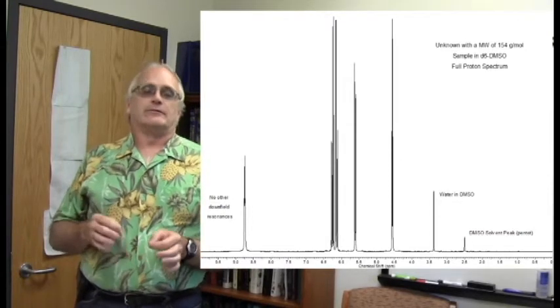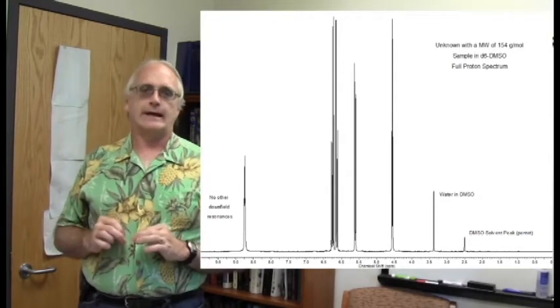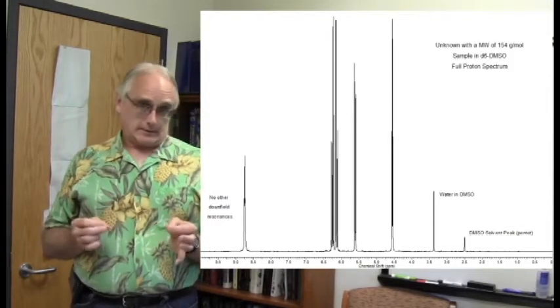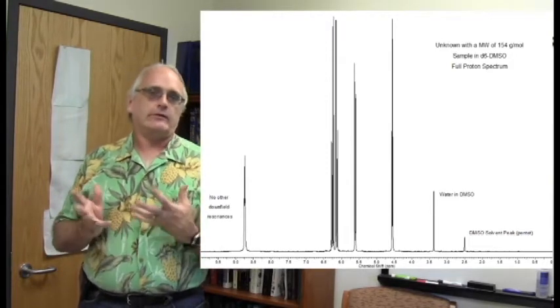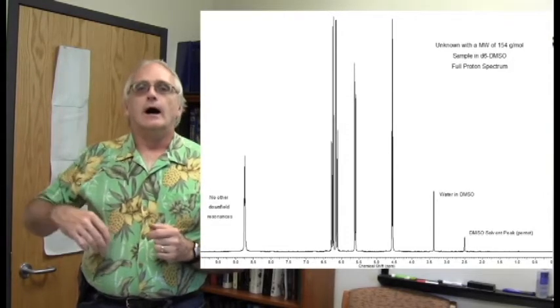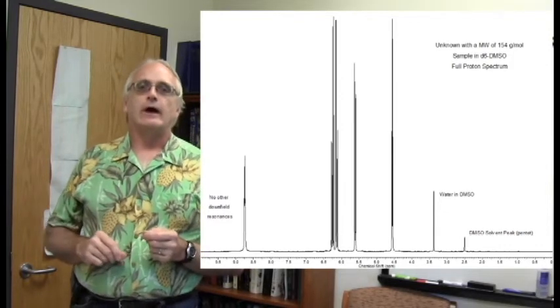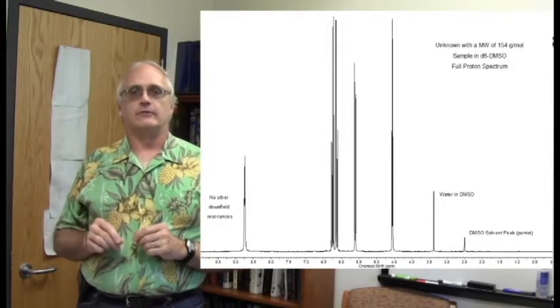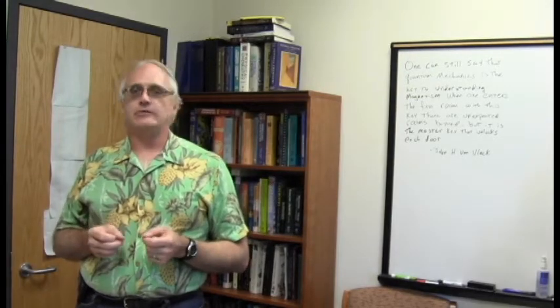The fact that the sample is relatively wet gives a little bit more evidence that the molecule we're analyzing, the one at 154 grams per mole molecular weight, could well be a hydrogen bonded molecule and hygroscopic. It's such a good hydrogen bonder that over the time it's been stored, it's been around a while, it has been absorbing water out of the atmosphere. And so the crystals of the material, while not soaked in water, actually probably have a fair amount of water on them.